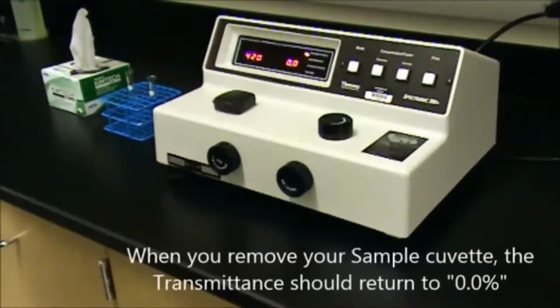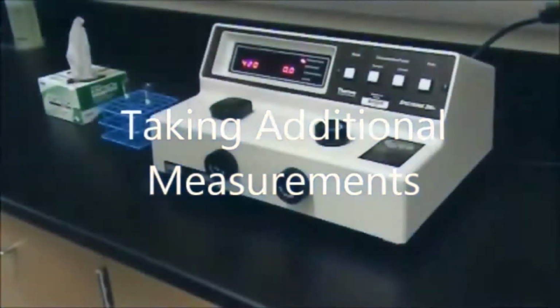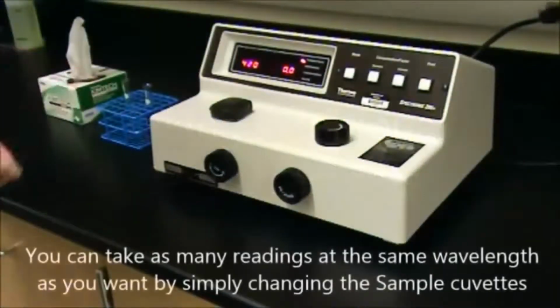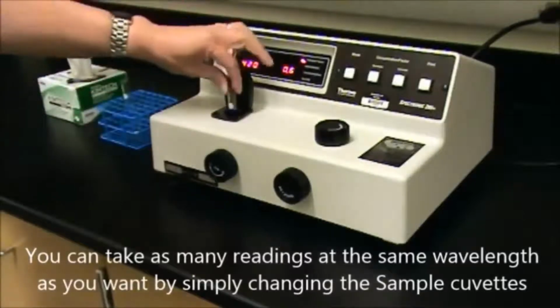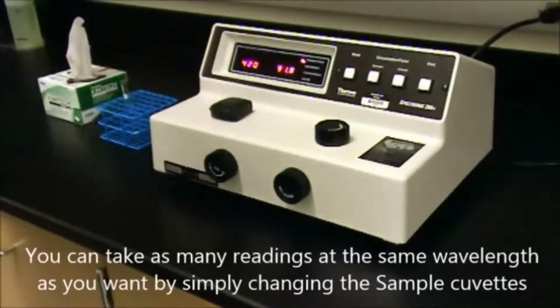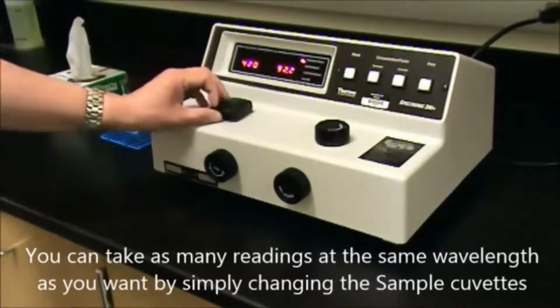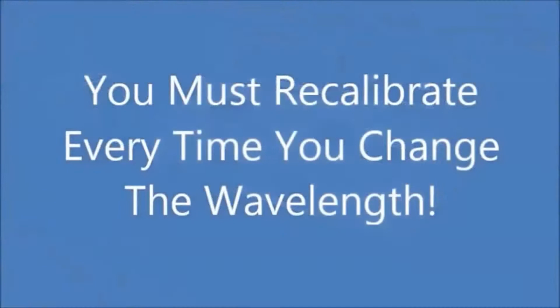When you remove your sample, the machine should return back to 0 transmittance. You can go ahead and continue to put new samples into the sample compartment and continue to take readings at the same wavelength that you just set the machine up for. So if you have 10 test tubes, you can now put all 10 of them in one at a time and note the readings.